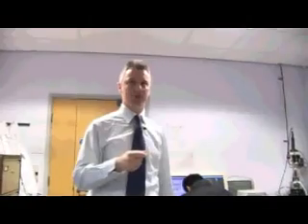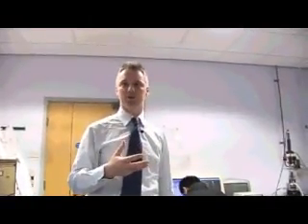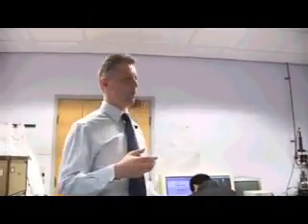Okay. Where are we now? So basically you're in one of our atomic force microscopy labs, and this is a special tool that we're particularly good at here that allows us to visualise nano-sized objects. And very importantly for us, it allows us to image them in liquids and biological environments. So when we're working to develop new medicines or new implants, we can actually look at those materials in the right environment. And that's a core skill that we have here.